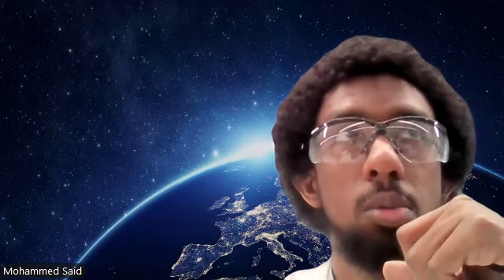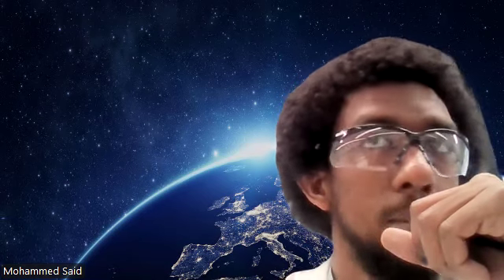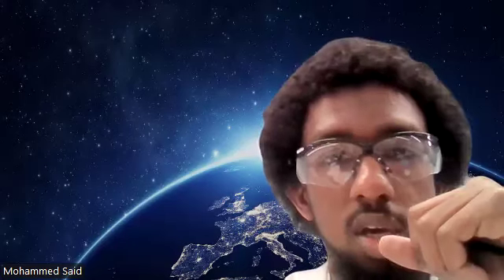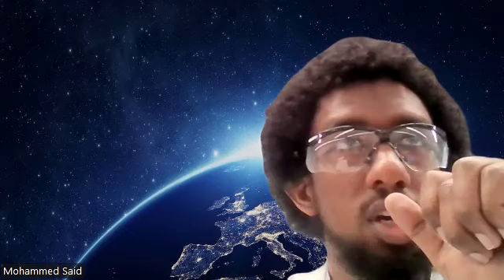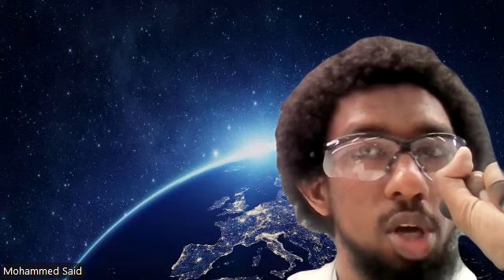And if you weren't able to observe, let's say for example, too few to count for the number of colonies in a specific plate, or there were too many, beyond the range of 30 to 300, then you essentially have to include that as your observations, either in a table or in Word format. Any questions regarding that?